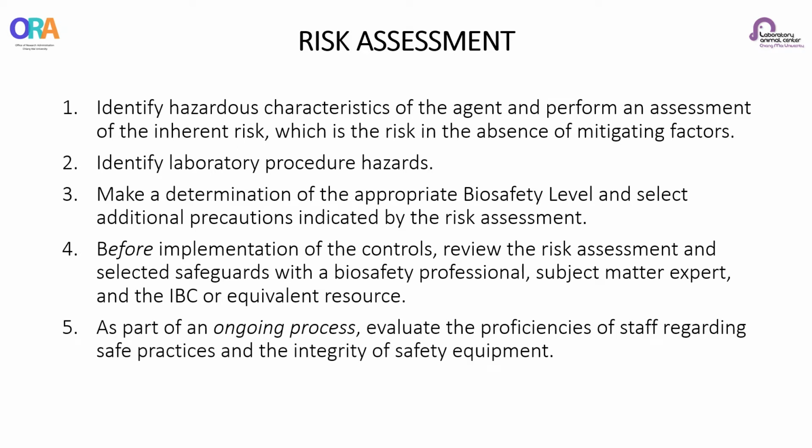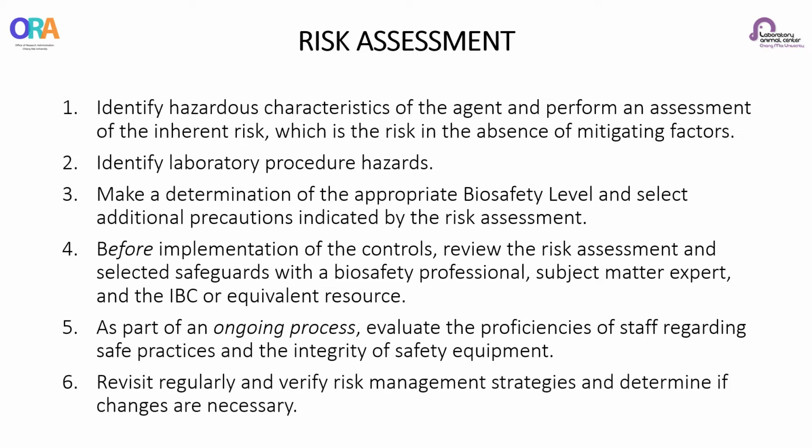Five, as part of an ongoing process, evaluate the proficiency of staff regarding safe practice and the integrity of safety equipment. Six, revise and verify the risk assessment or risk management strategy and determine if changes are necessary.